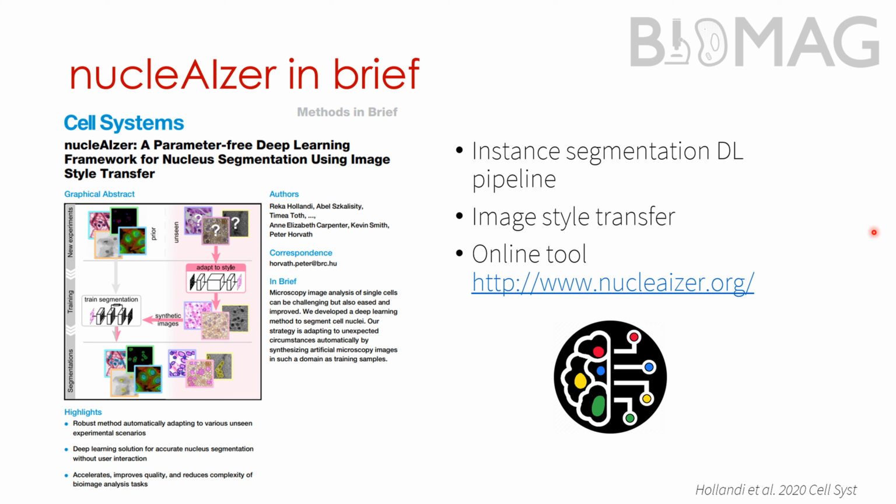We dubbed this method nucleAIzer, and it is an instance segmentation pipeline using image style transfer. We also created an online tool for it that you can find at nucleAIzer.org. And how we use this for image segmentation is shown in this figure.